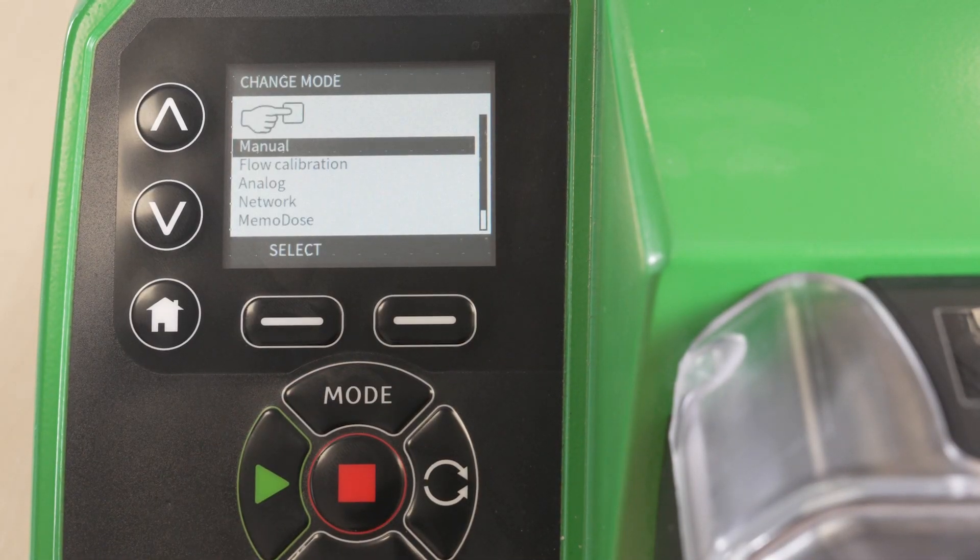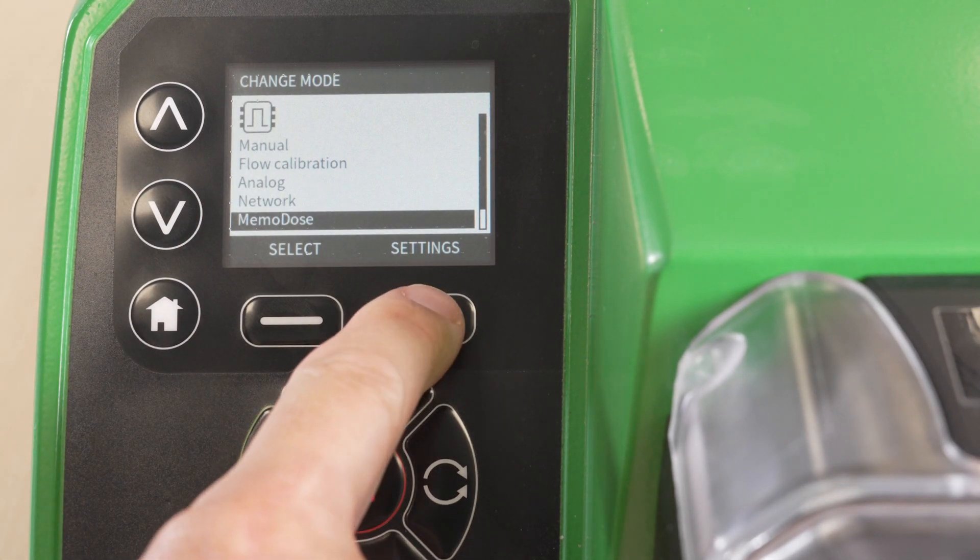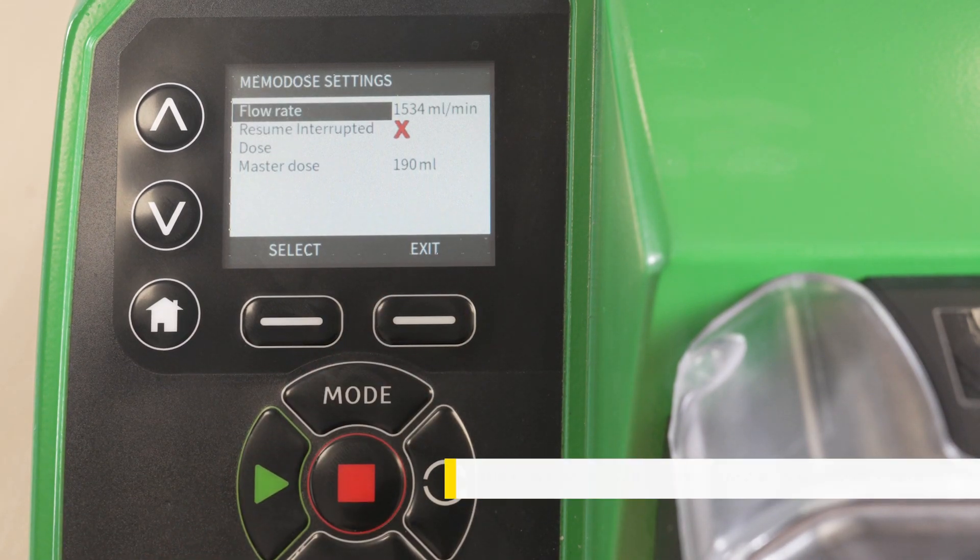Select Mode. Navigate to Memodose using the arrows. Select Settings. Enter the flow rate.